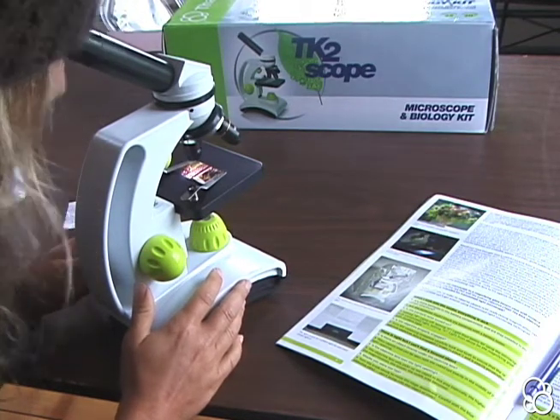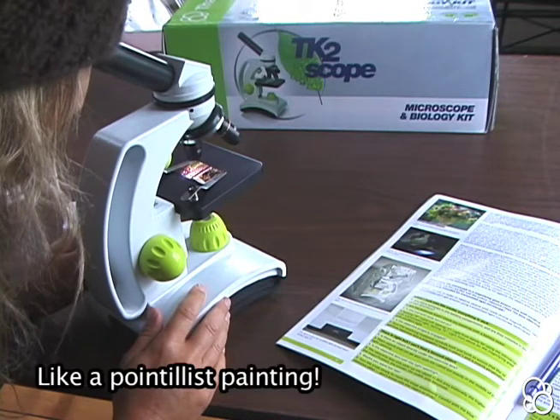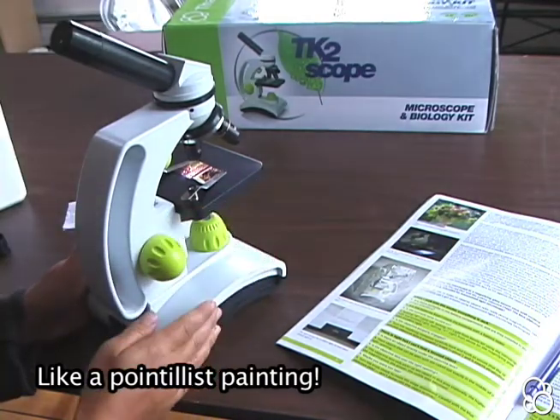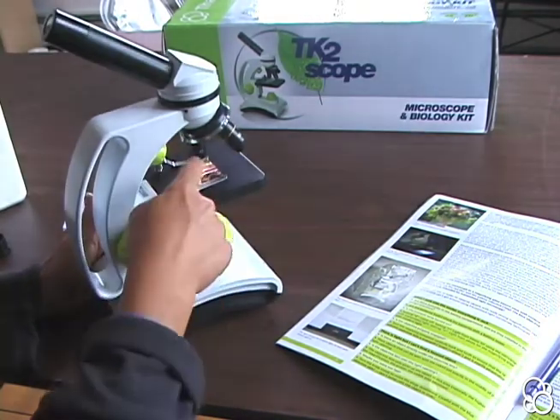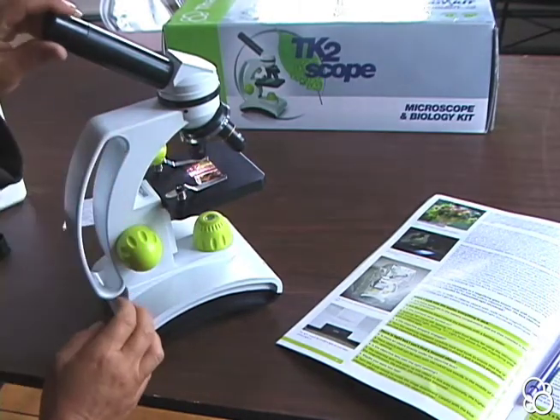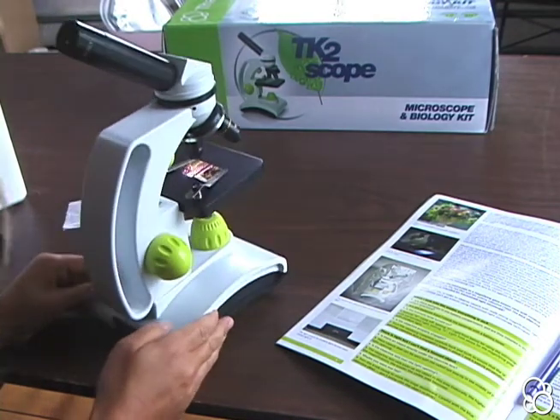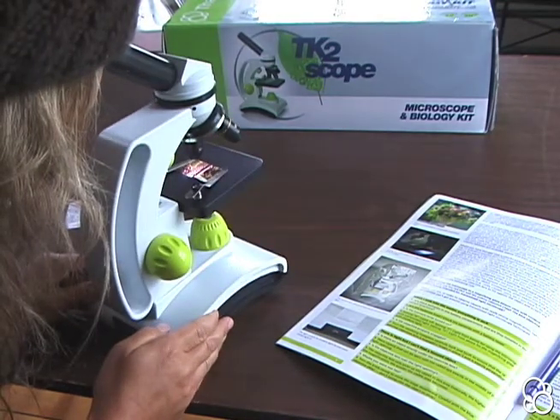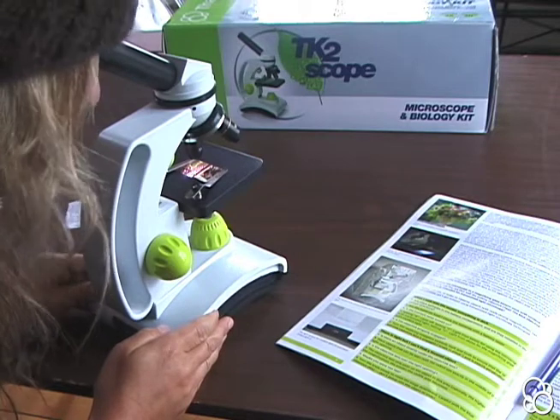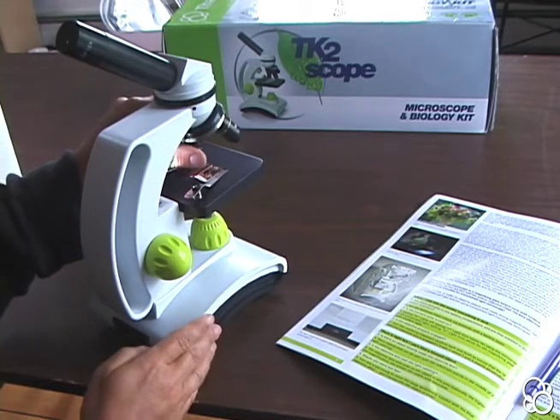You might be surprised to see what an image from a magazine looks like close up — it's just a bunch of dots. This image is magnified by the number on the objective lens multiplied by the number on the ocular lens, so that would be 4 times 10, which is 40. You're looking at the image magnified 40 times its actual size.